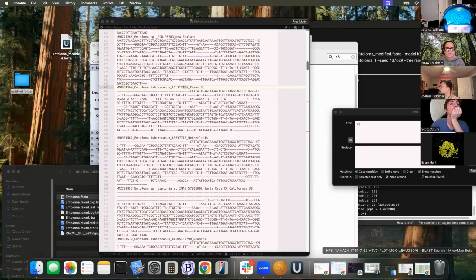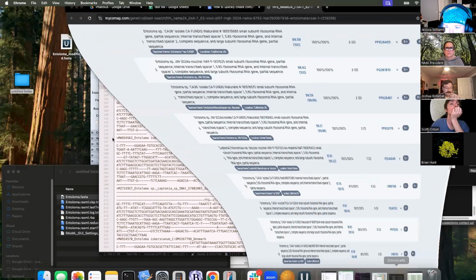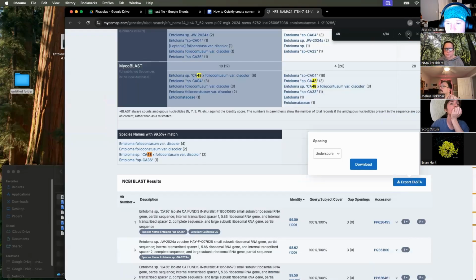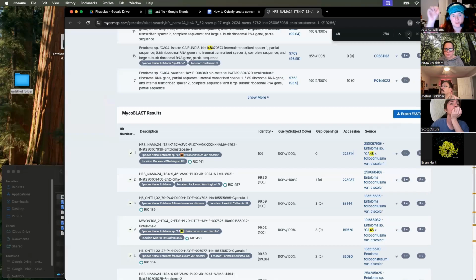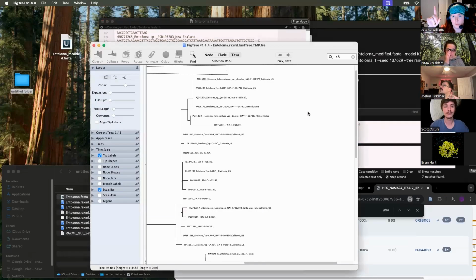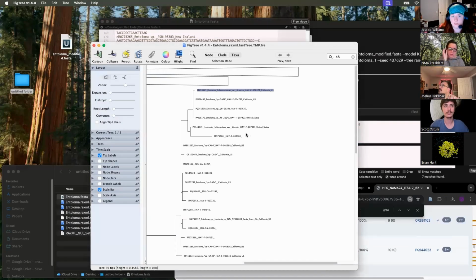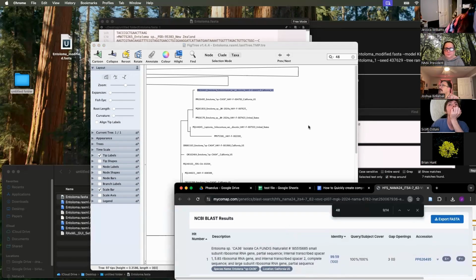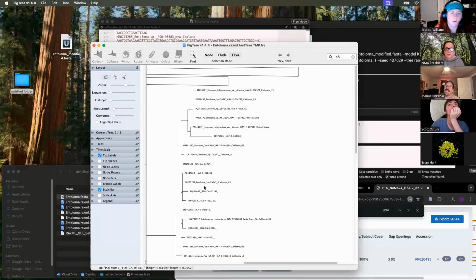But the thing is, like I said, it's probably mostly pulling the provisional species names, and that is probably what you're seeing, because we moved to the GenBank format for the names for new temp codes. So it's a single quote, sp dot single quote temp. I'm not seeing those, so all of these that are kind of weird are probably the hybrids. So it might take a little manual renaming of your data set. Yeah, good to know.